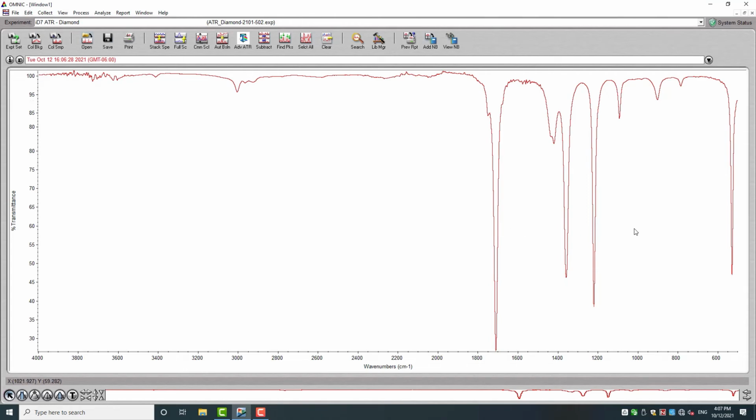Infrared spectra of organic compounds have two general areas. They are the functional group region and the fingerprint region. The fingerprint region contains the lower frequency oscillations, and peaks in this region arise from complex deformation of the molecule, angles bending, or atoms rocking back and forth. They are not representative of any particular functional group, but are very useful when trying to identify unknown samples.